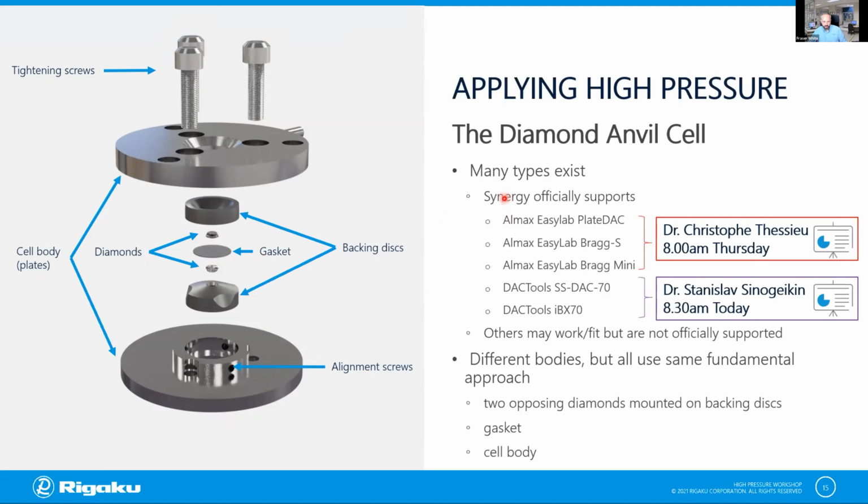So our synergy system officially supports these cells here. So there's a small list here. That's not to say that other cells won't work. This is just the list of officially supported cells. And we will have 2 talks on these cells. One is immediately after this presentation, and the other one is tomorrow, first thing. And these will be presentations on these offerings and other offerings from the companies that make these Diamond Anvil cells.